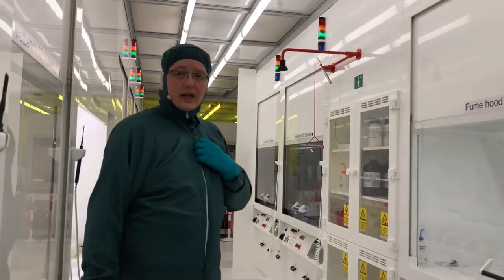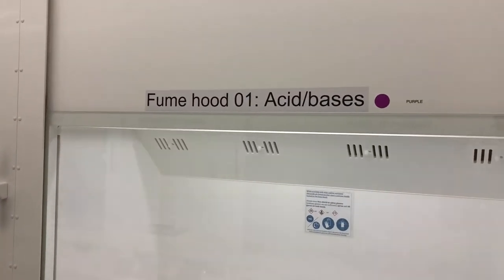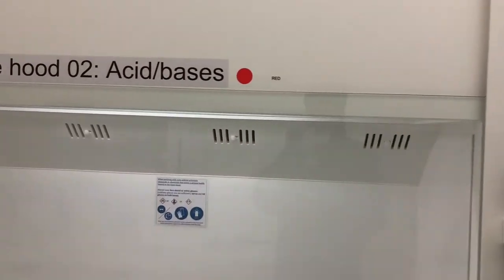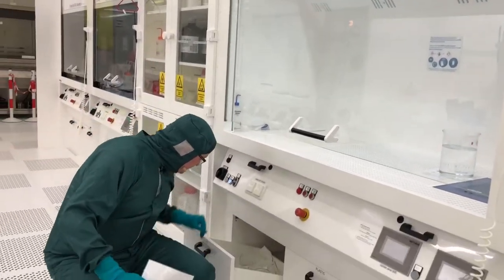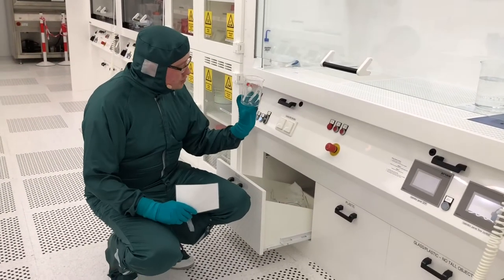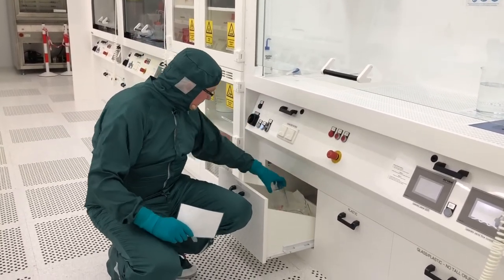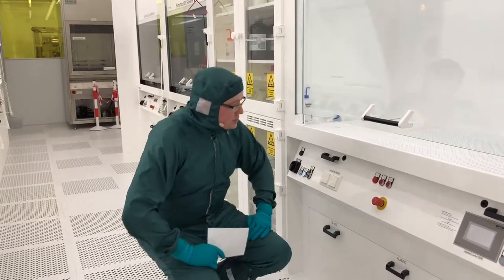Besides the name, we also have color coding of all the fume hoods. This color coding indicates the glassware that belongs to each fume hood. For example, fume hood 2 is red, meaning the glassware for this fume hood is also marked red, so you know which glassware belongs here. Make sure you put it back in the right place when you are done using it.